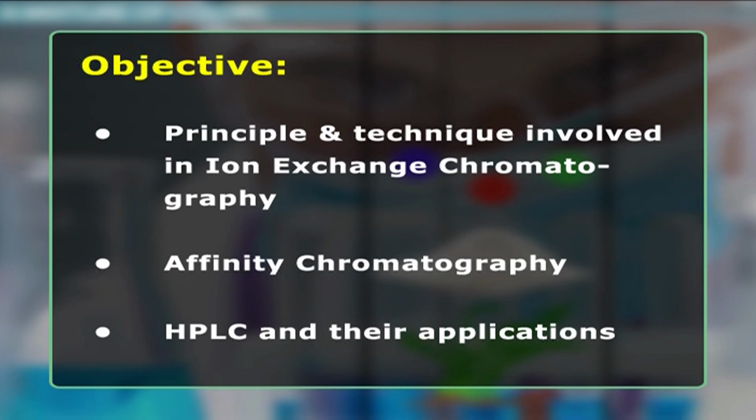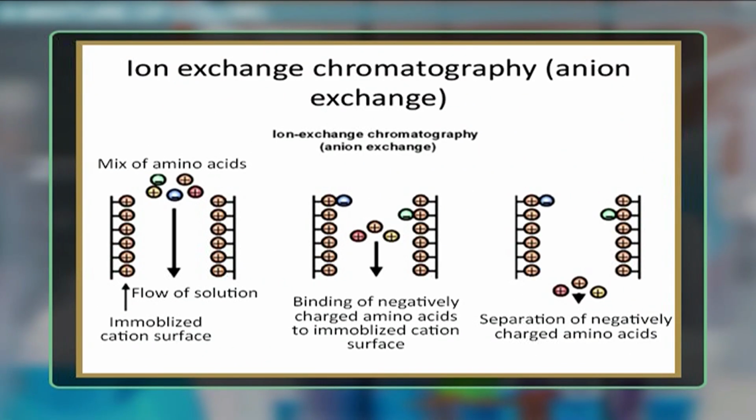and their applications. Ion exchange chromatography (IEC) is part of ion chromatography, which is an important analytical technique for the separation and determination of ionic compounds, together with ion partition, ion interaction and ion exclusion chromatography. Ion chromatography separation is based on ionic or electrostatic interaction between ionic and polar analytes, ions present in the eluent and ionic functional groups fixed to the chromatographic support.